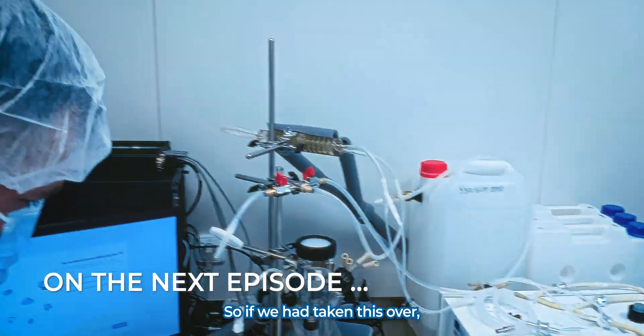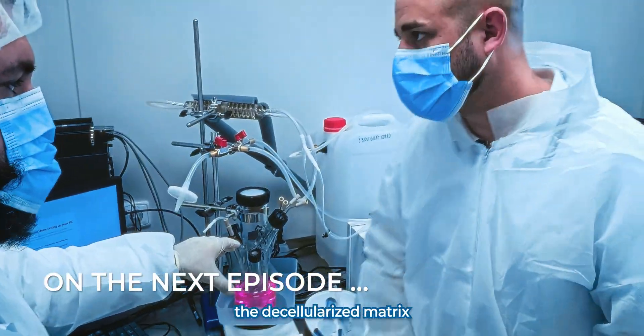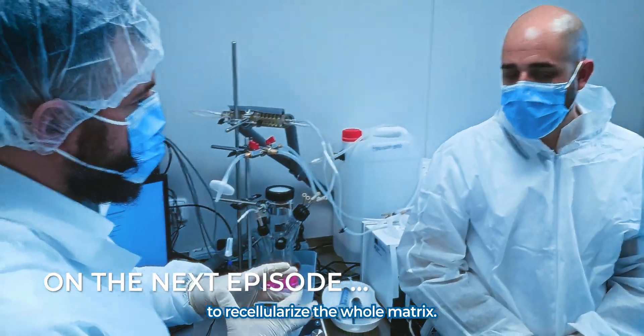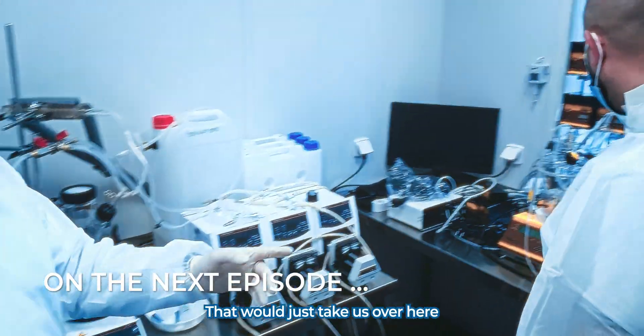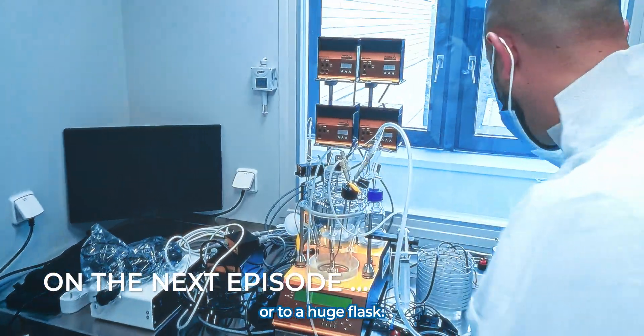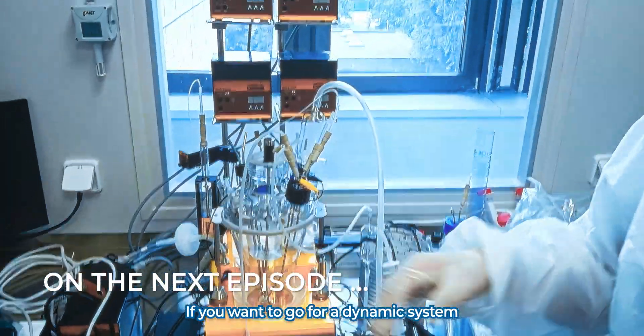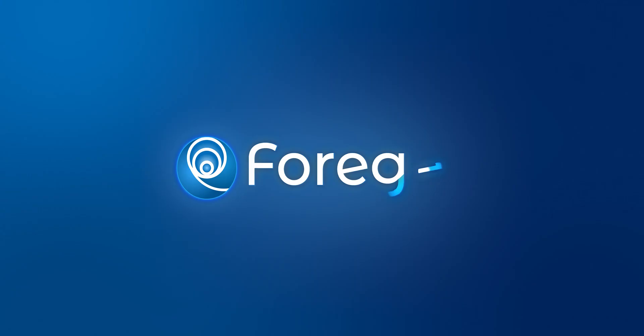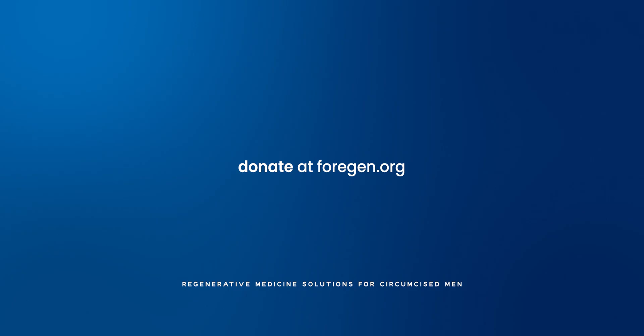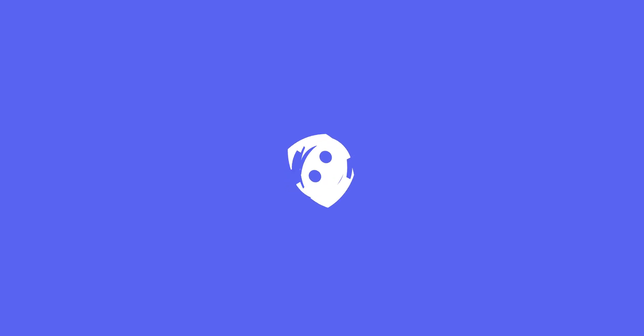So, if we had taken this over, we had taken out the decellularized matrix, and we were getting ready to recellularize the whole matrix, that would take us over to this matrix. It would just take us over here, or to a huge bioreactor. If you want to go for dynamic system or static system.